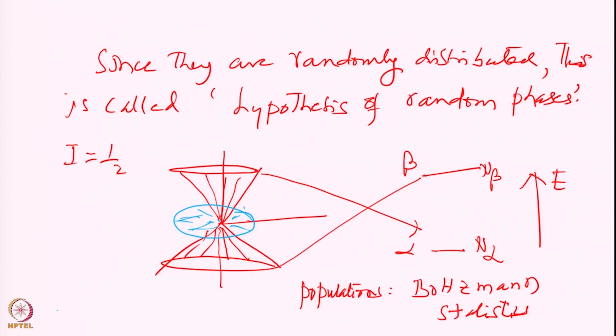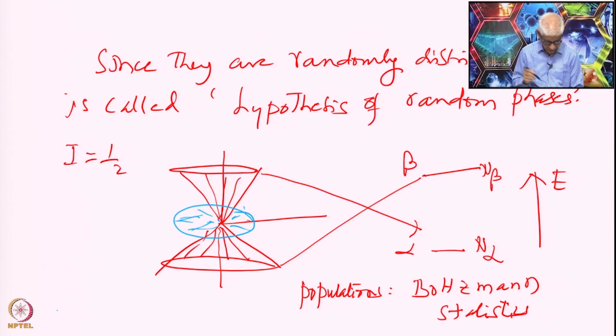The z component, there will be a positive z component as well as a negative z component. These are not equal.